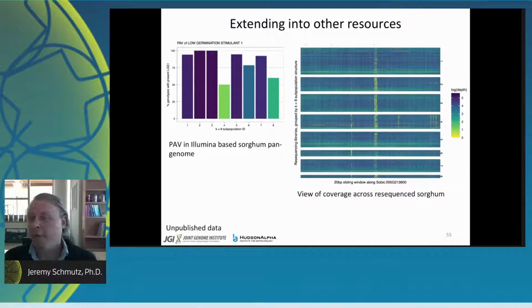And then if we go back to look at, say, 12 to 1300 resequence libraries, looking at just the gene, you can see all coverage variants across this region. And here, these are the insertion deletions that are described in the paper. There's also another one up here that really also can contribute to knocking that out. And this one's across a whole set of different subpopulations.